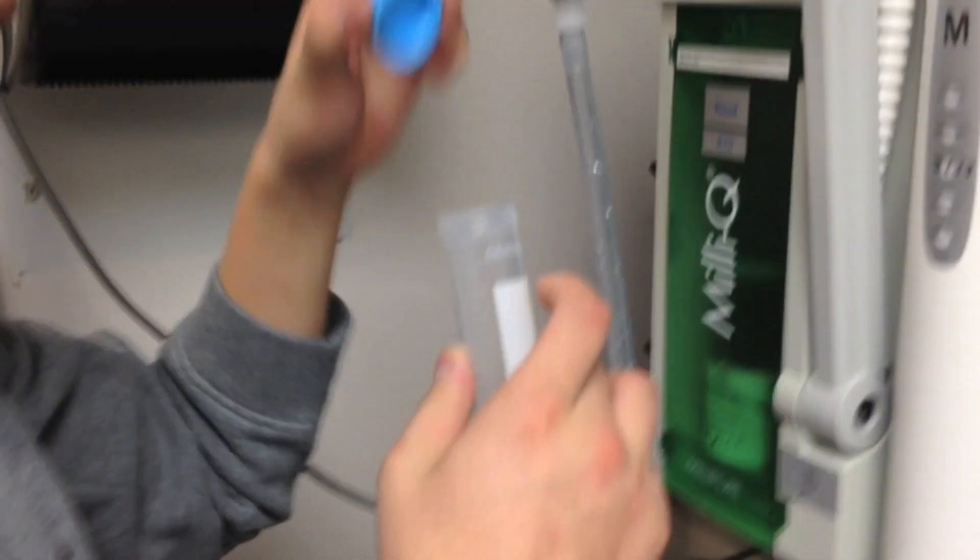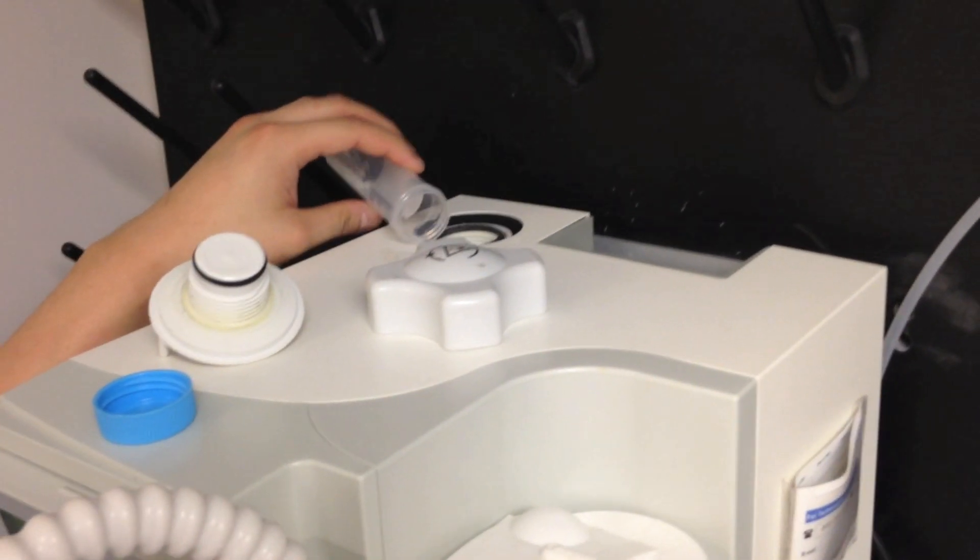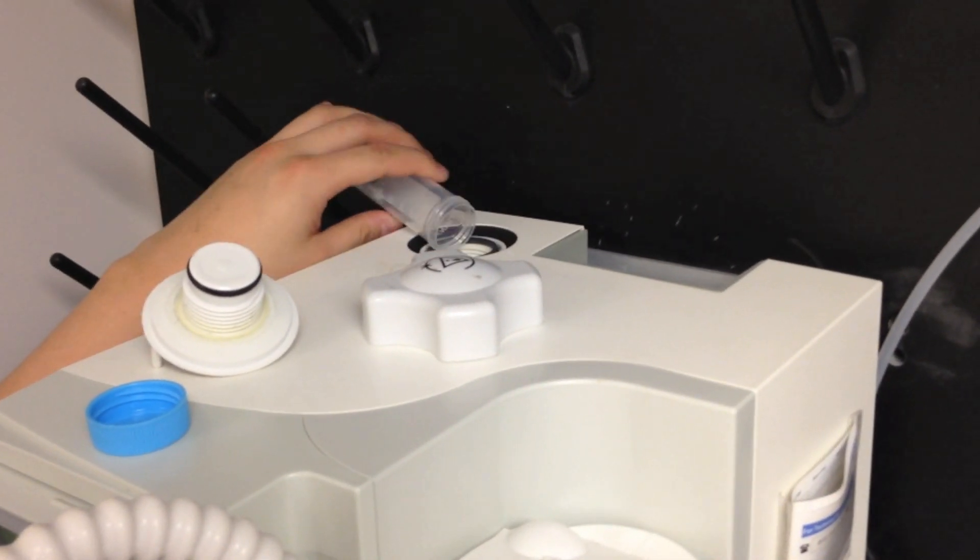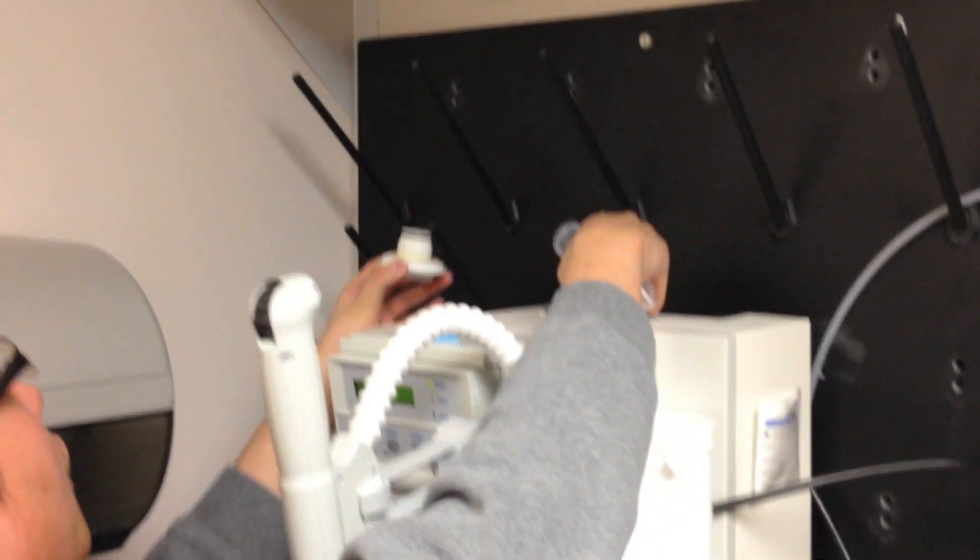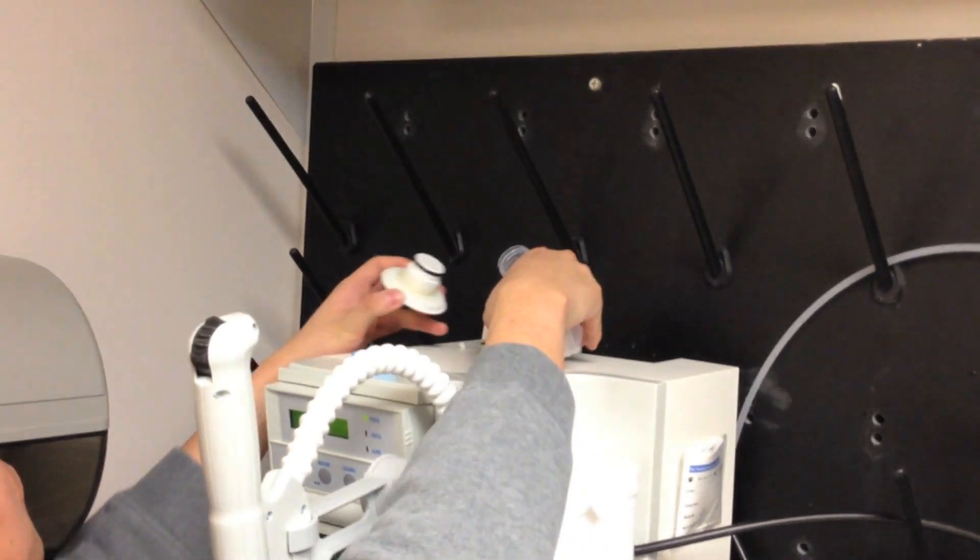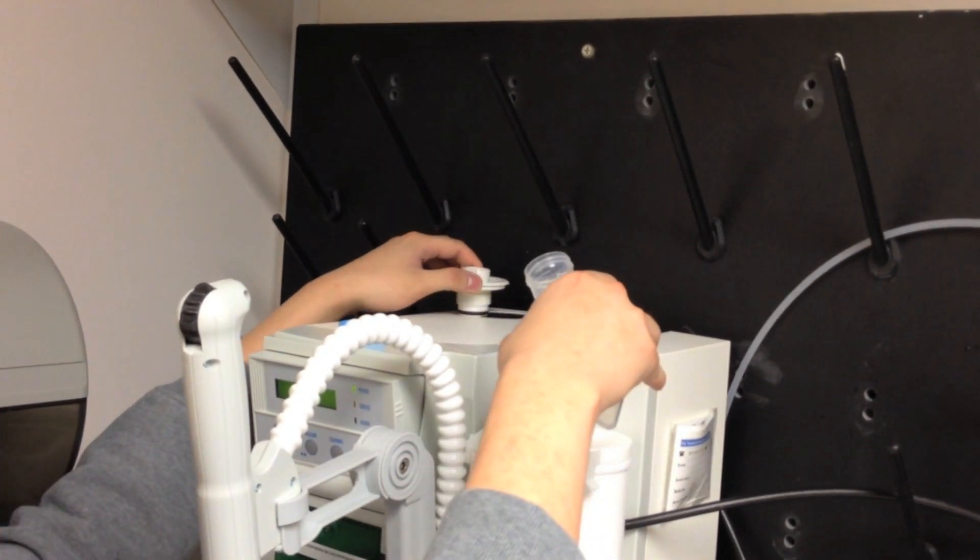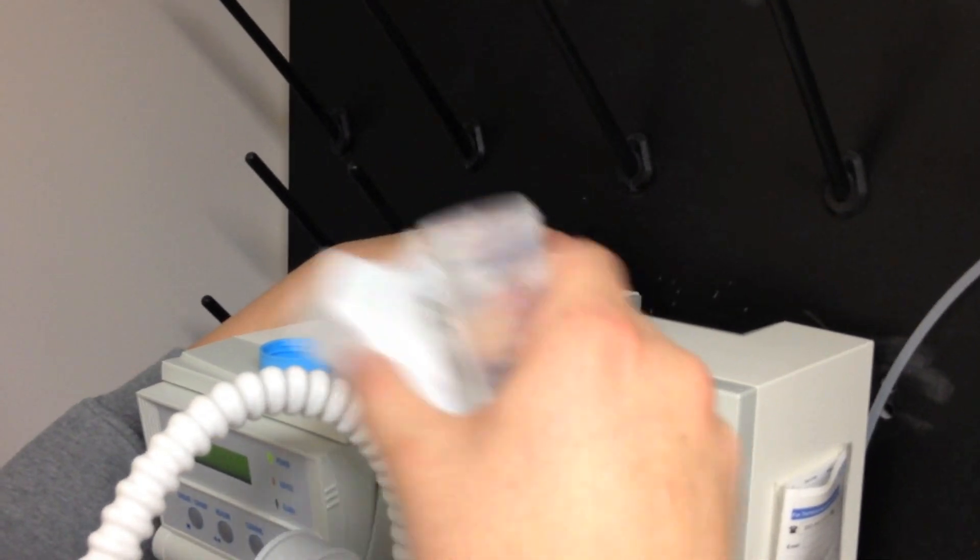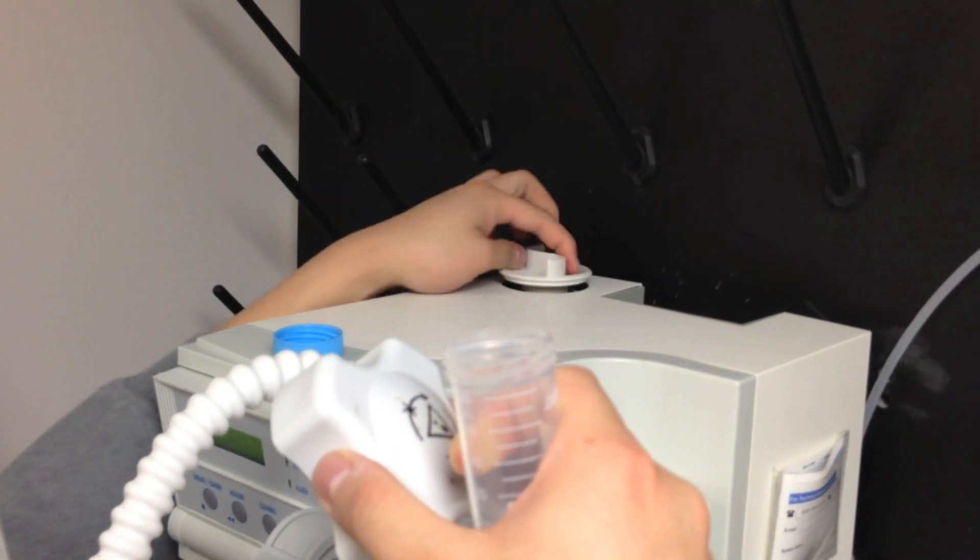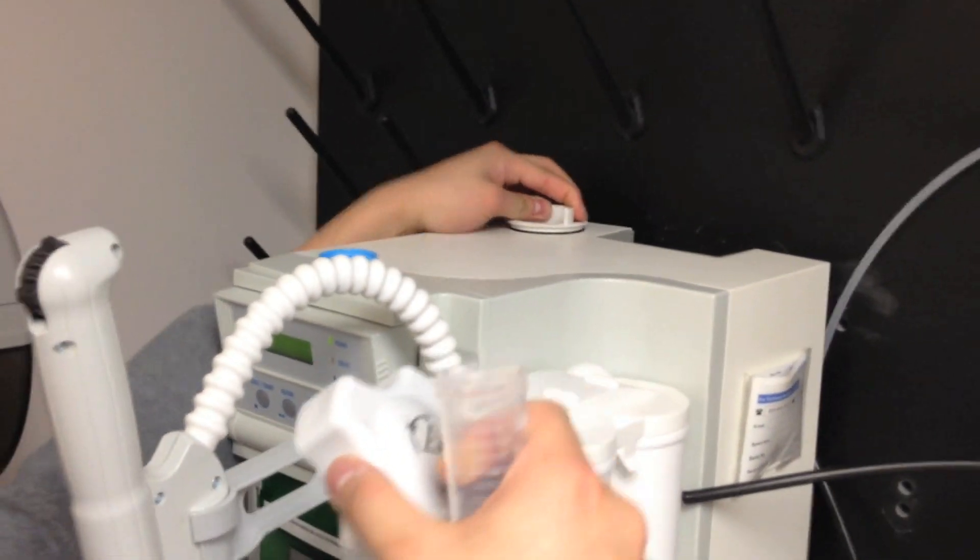Now put in your 3 grams of sodium hydroxide. Now you put the cap back on, and remember, don't use this opener. Just hand-tight it, otherwise it will be too tight. That should be good.